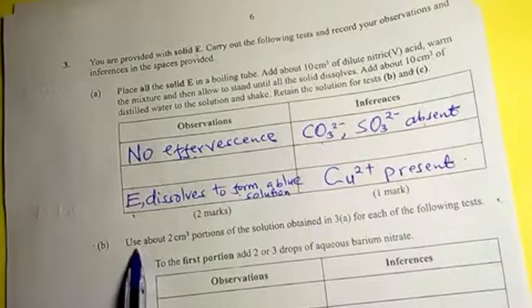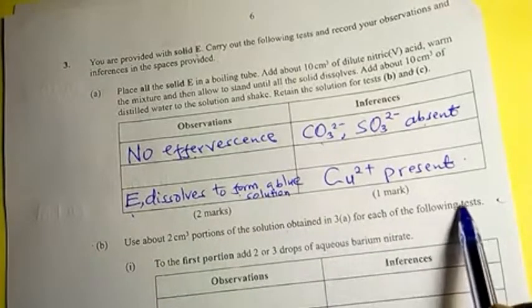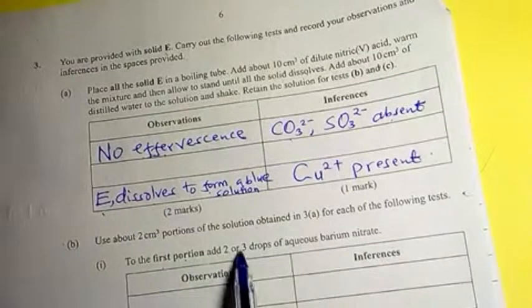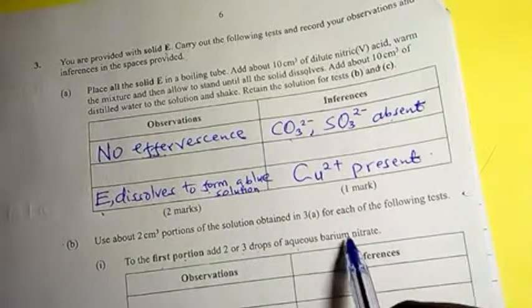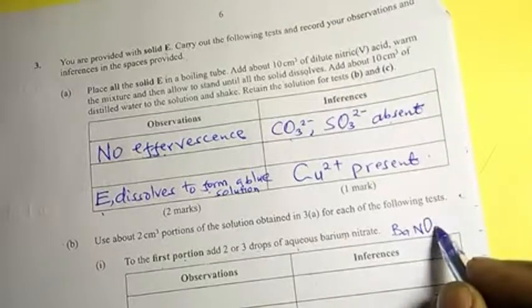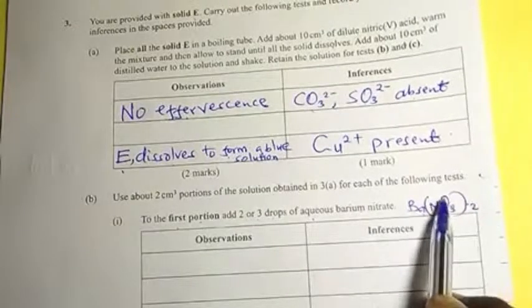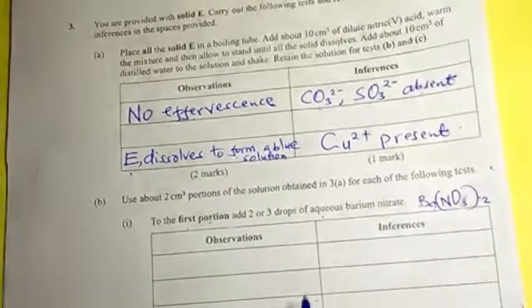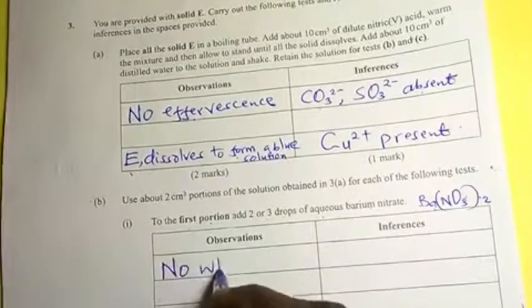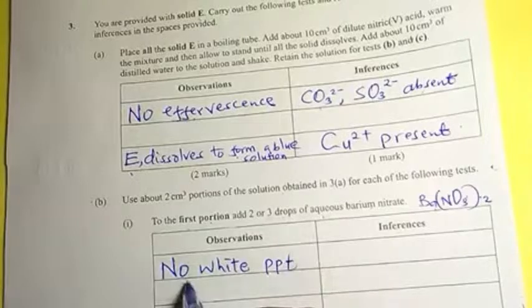Use about 2 cm³ portion of solution obtained in 3A for each of the following tests. To the first portion, add 2 to 3 drops of aqueous barium nitrate. We are adding barium nitrate. Remember, we have talked about barium nitrate. We expect a white precipitate or no white precipitate. So for this case, there was no white PPT formed.